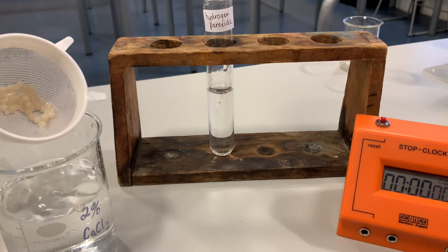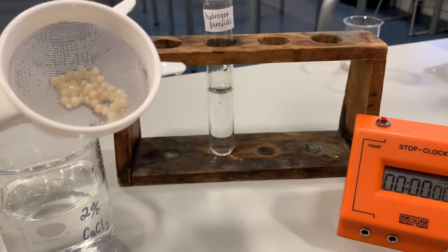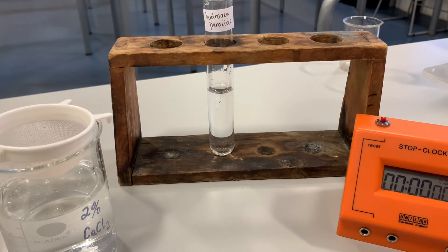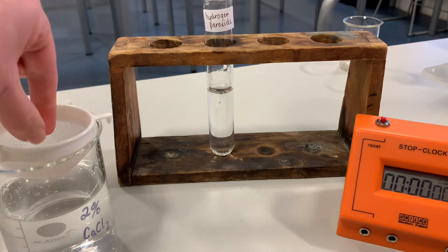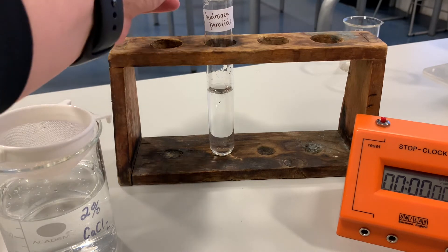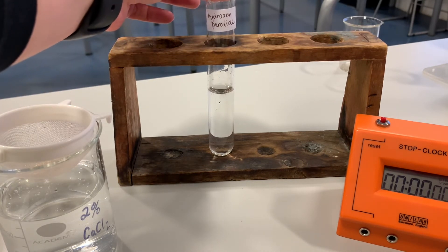What we've got now is our immobilised yeast beads that we made earlier. Remember the yeast contains the catalase, which is the enzyme we're interested in here. In the test tube we've got hydrogen peroxide. When that is broken down by catalase it forms oxygen and water. Oxygen is a gas, so when the enzyme is doing its job the gas should cause our immobilised beads to rise to the top of a boiling tube of hydrogen peroxide, and we can time how long it takes for that to happen.